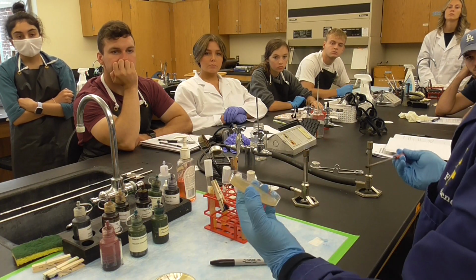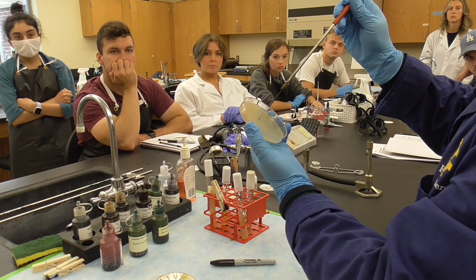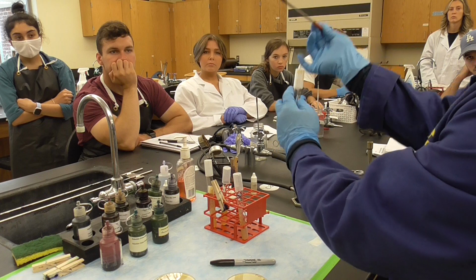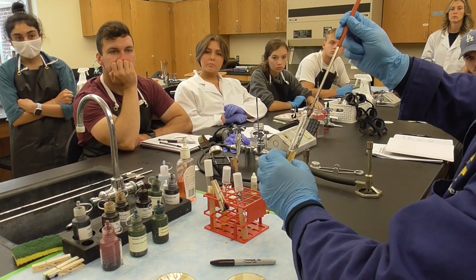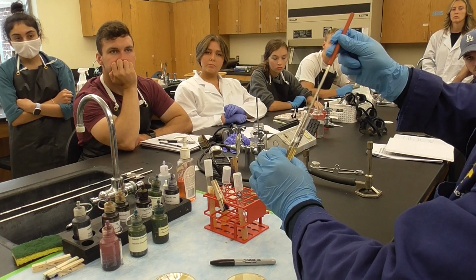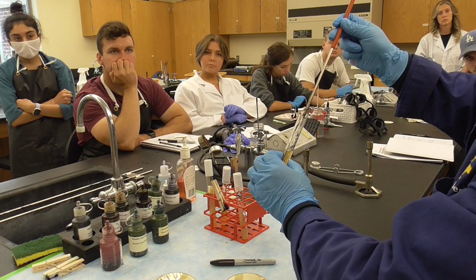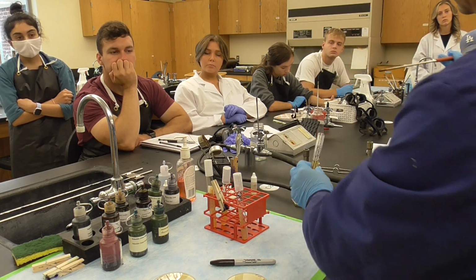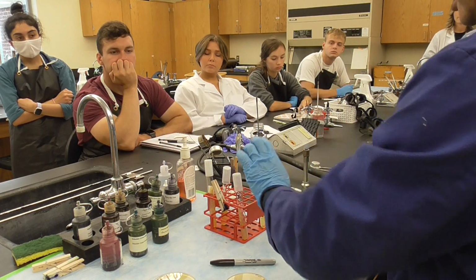So plate, you have the bacteria right here. Let this cool down. And then pick some colony. Okay. Then put it here, flame, and then go and shake a little bit. The reason why you have to sterilize a little bit on the top is because this metal area is also going to touch the bacteria. If you don't do it, it will be transferring the bacteria inside. So that's all.